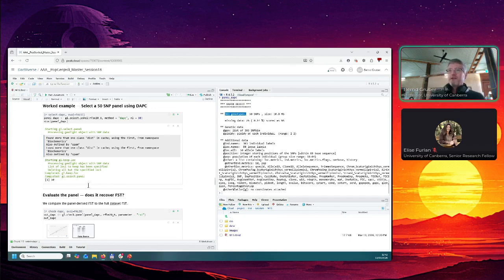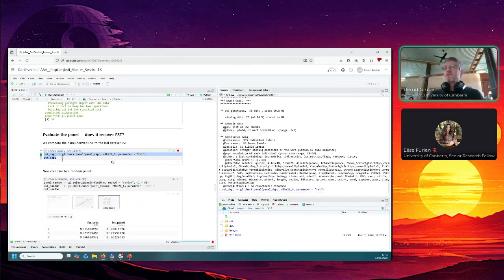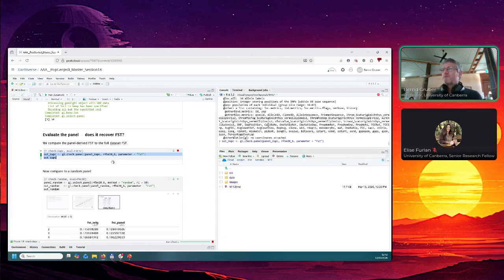And now the question is, how good is that? We came up with this way. There might be better ways, so please be patient. We used R square values. It's probably not the best one, because you also want a measure of the variation around it. So maybe there's some other metric, but at the moment we have that. It's very simple. It uses the panel and the original data set and makes a nice plot, hopefully.